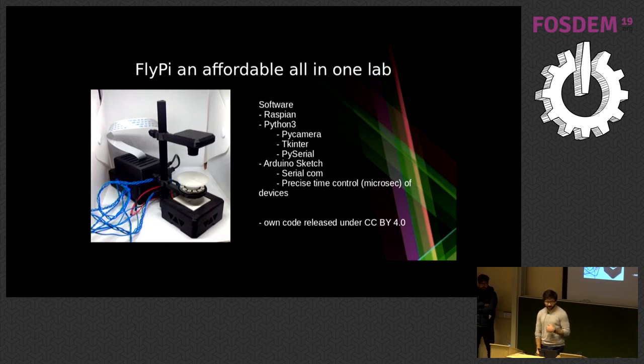And in terms of packaging, in a way, we're kind of stuck to the same hardware all the time, right? So in a way, it's a little bit easier: once we have everything working, we just prepare an SD card image and make that available online. Yeah. So people can just download the SD image.